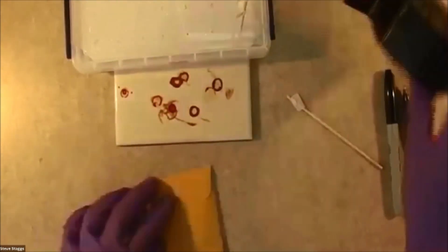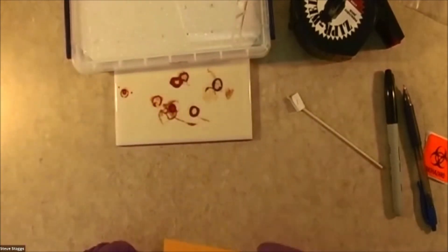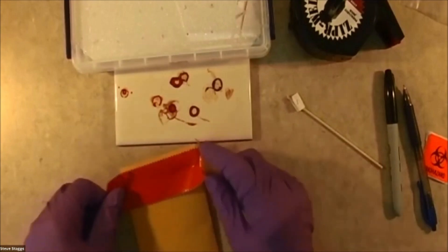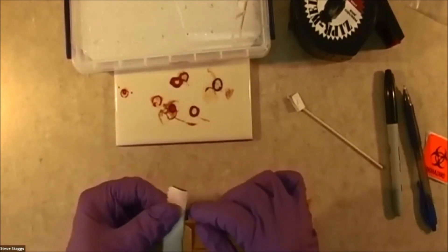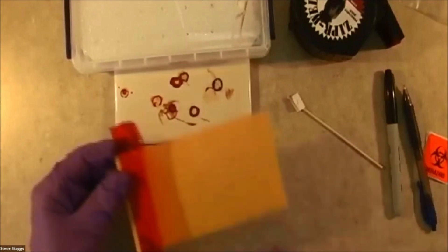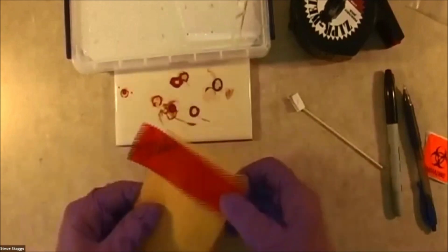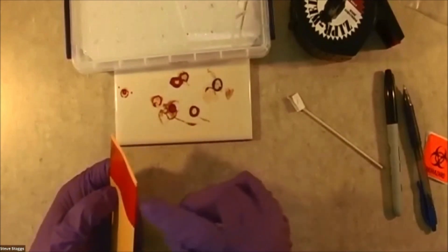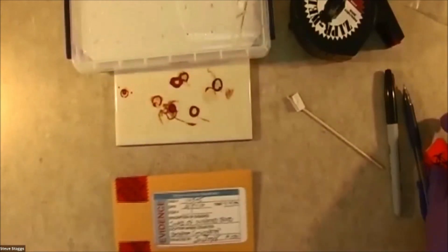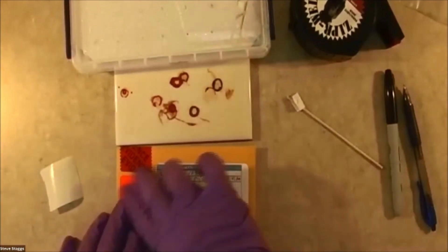I'm going to use our evidence tape. The evidence tape should be just a little bit longer than the width of your opening. I've got it completely sealed. And then because this is suspected bloodstain, I'm going to take my biohazard sticker and apply it.